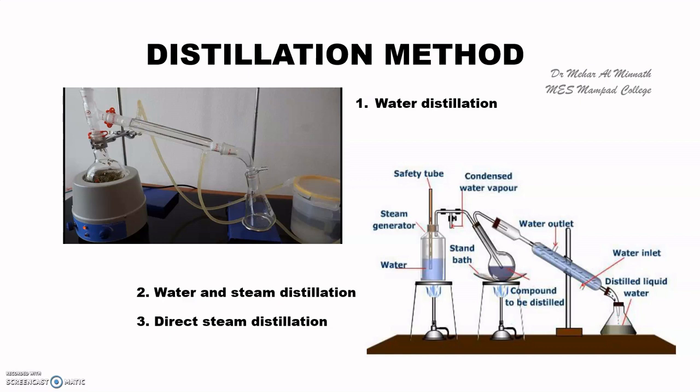Now the steam and water distillation is faster than the water distillation method. But there are a few disadvantages for this method. Due to the low pressure of rising steam, oils of high boiling range require a greater quantity of steam, so longer hours of distillation will be required. And since we are macerating the plant material, the plant material becomes wet, and that will slow down the distillation. Now that's another disadvantage.